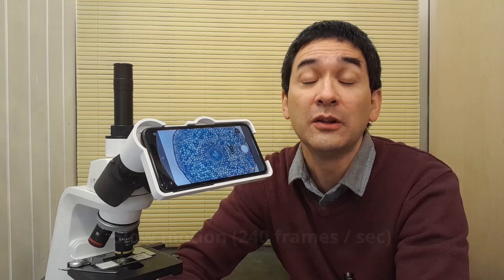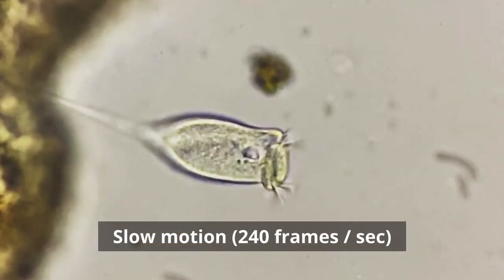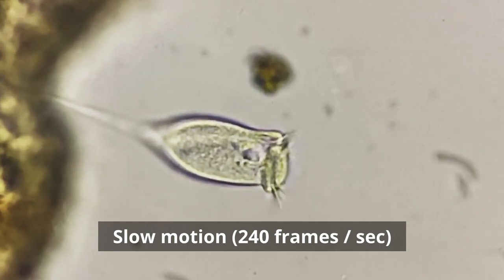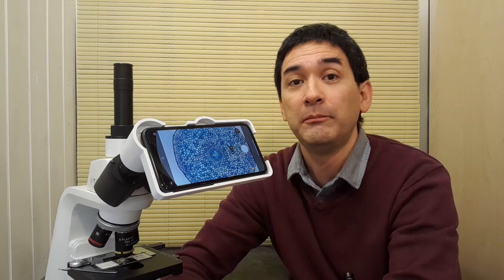That's not easily possible otherwise and if you use a standard high definition then you can also do slow motion videos because it has a very high frame rate and therefore you can slow down a very fast movement. So in case if you want to document fast moving microorganisms, I mean honestly with a USB camera that's connected directly to computer this would not be possible because the USB connection is simply too slow.